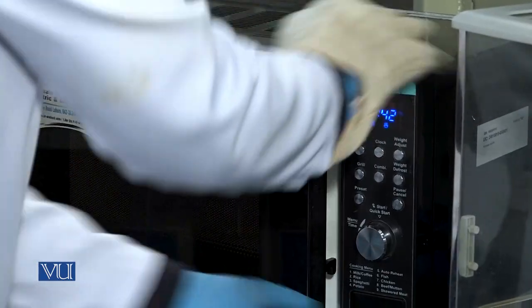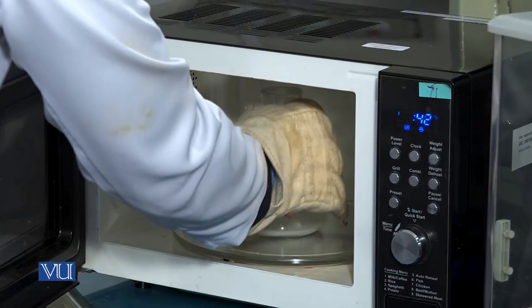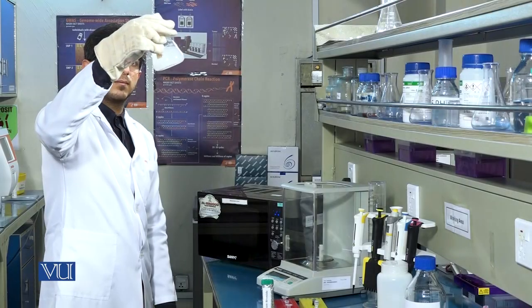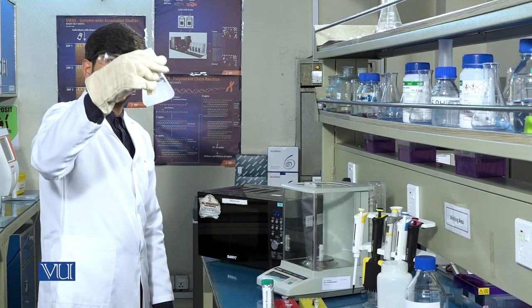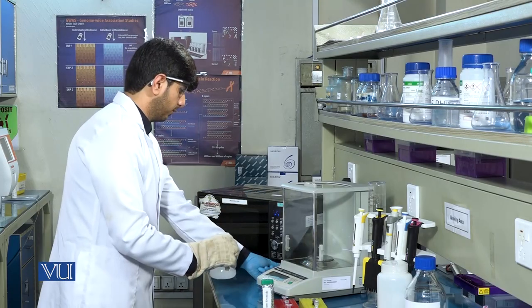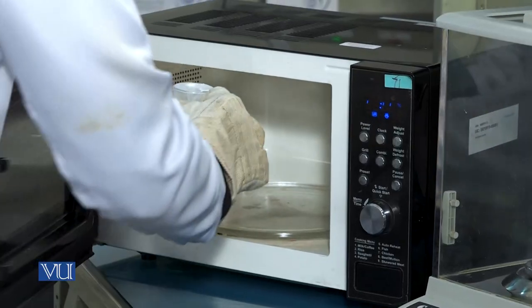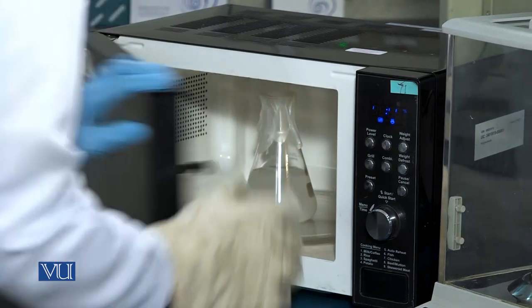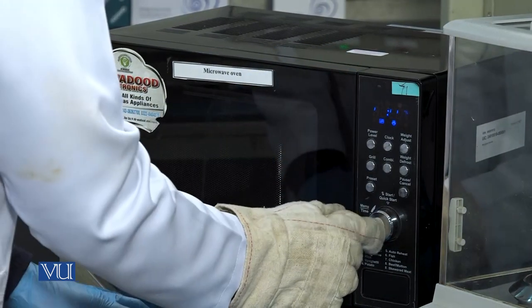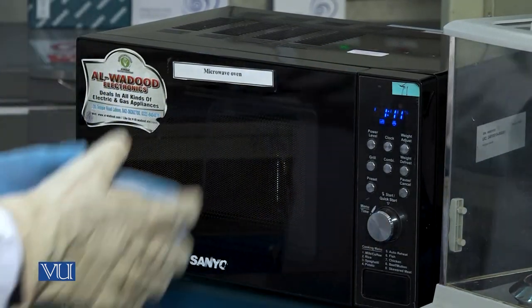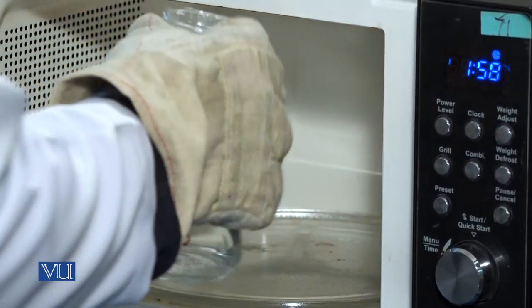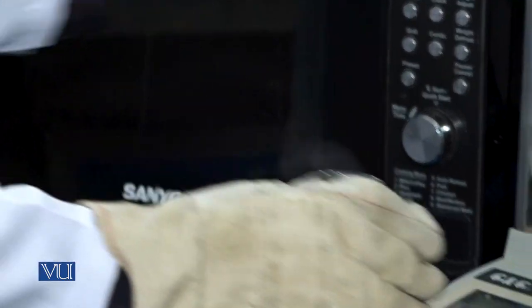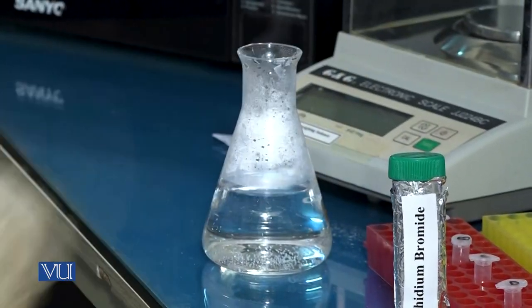After one minute, take out the flask with the help of heat-resistant glove and see whether contents have been dissolved or not. If contents are not dissolved, place the flask again in the oven until solution becomes clear. Let the flask cool for some extent.